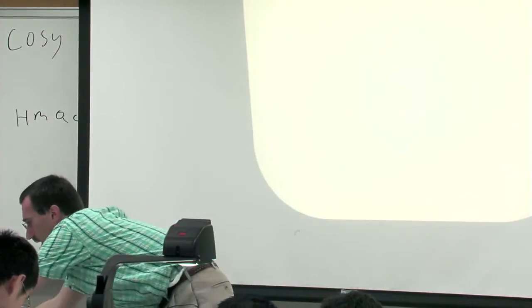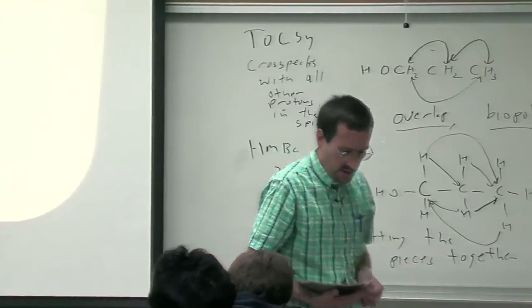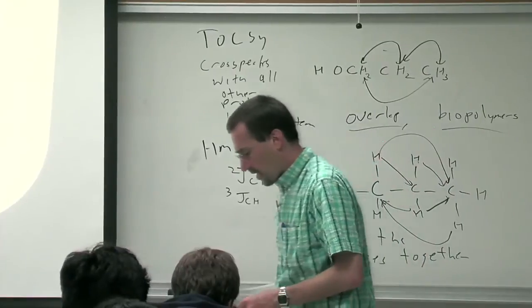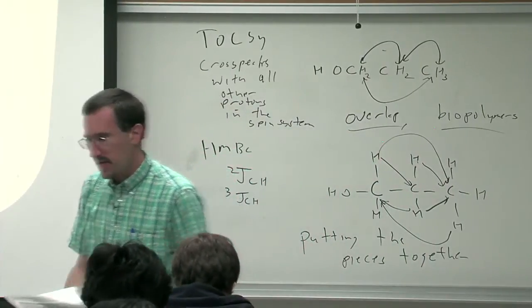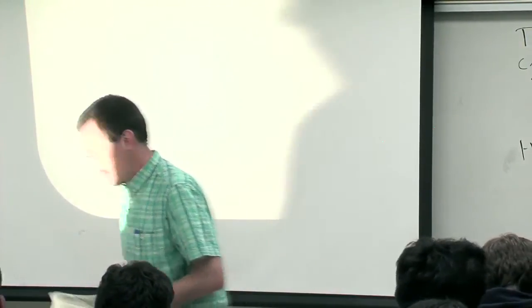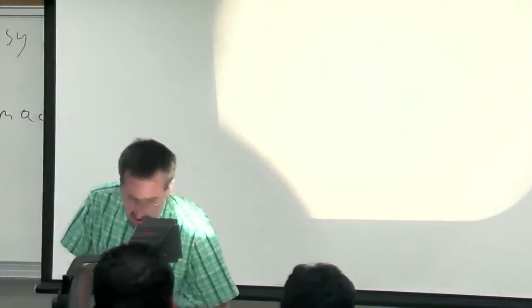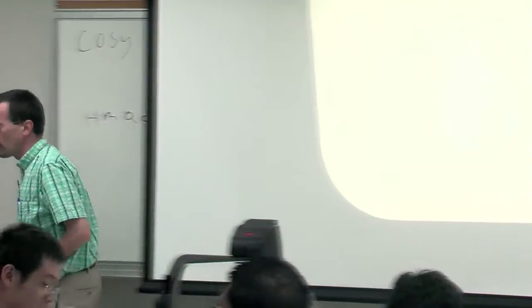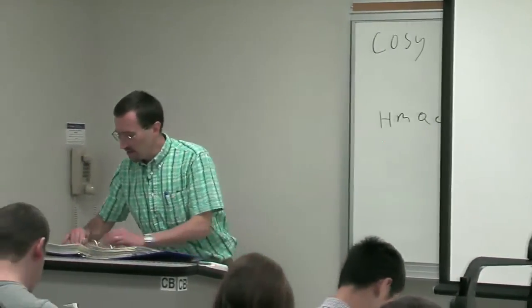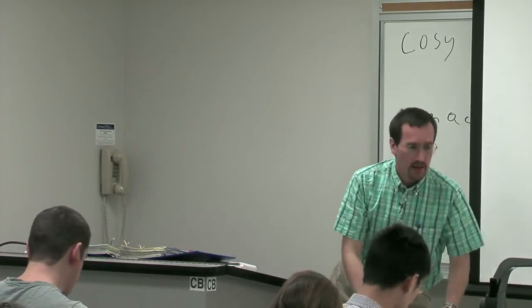Now, the other thing I would like to give you is a tool that's useful, particularly when you get more crowded spectra, and that's these grids. They're very useful in helping you line things up. They're yours to keep. And you can print more on transparency film, or if your lab mates are envious of you and steal them, you can go ahead and get them.